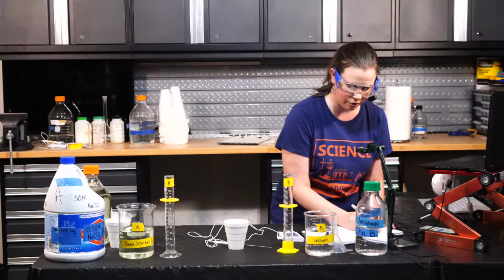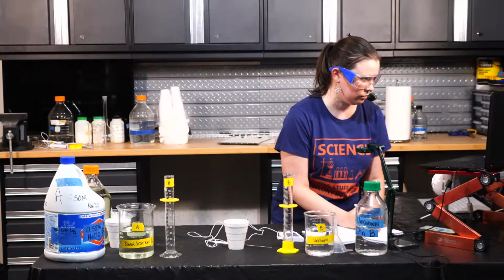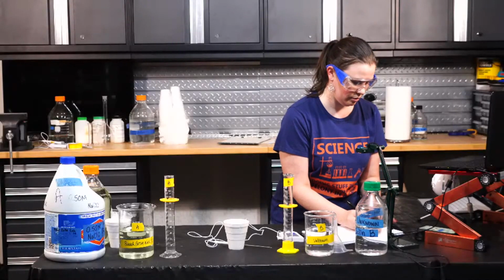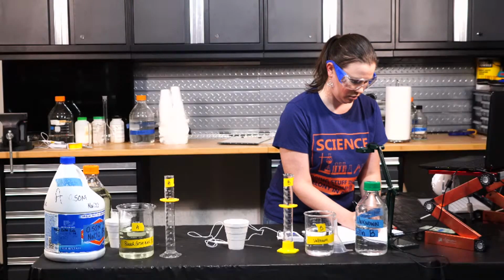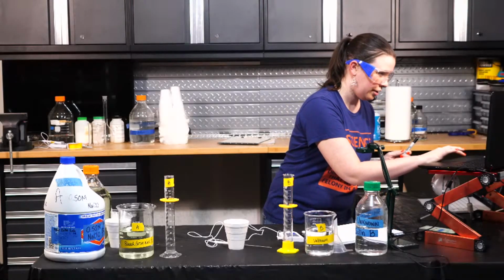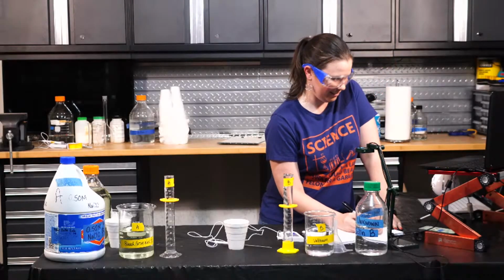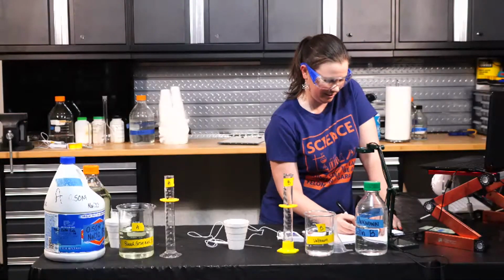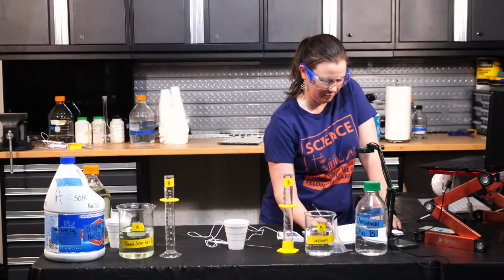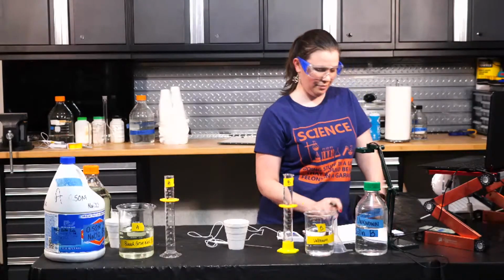Okay, so then how much of solution B? If we're keeping the volume at 50 consistent, if it were 5 milliliters of bleach, then 45 of solution B, and so on. You tell me. 45, and then 35, and then 25, 15, 5. Like that? Yeah, that looks good.